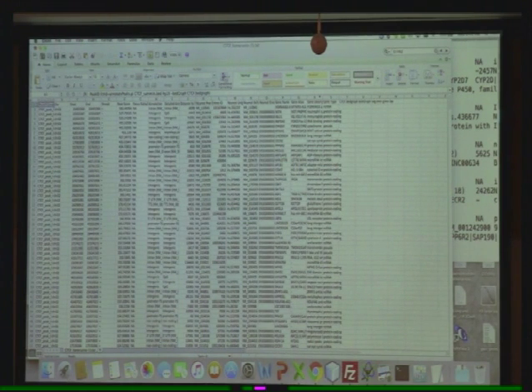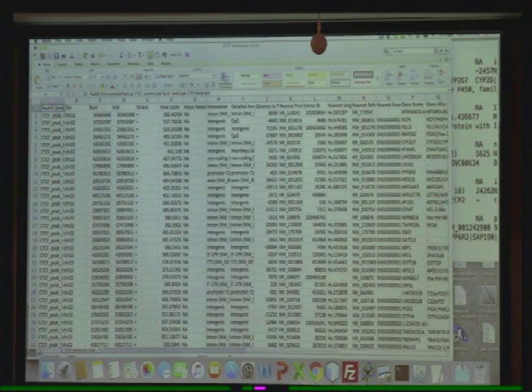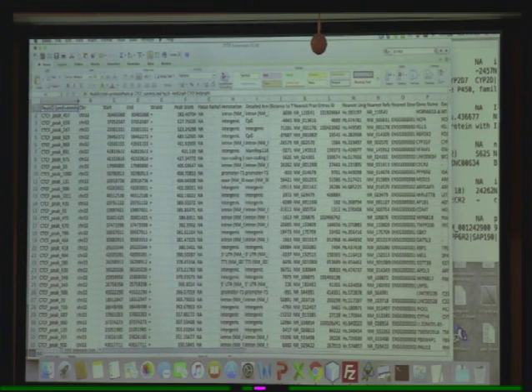This is the homer anno.txt, the CTCF_homer annotation. This is the one we just created with Homer. To open this on theirs, they need to use Office or a generic program. I could just run through the file. We're not going to go into this any further, just to show you what the output is.